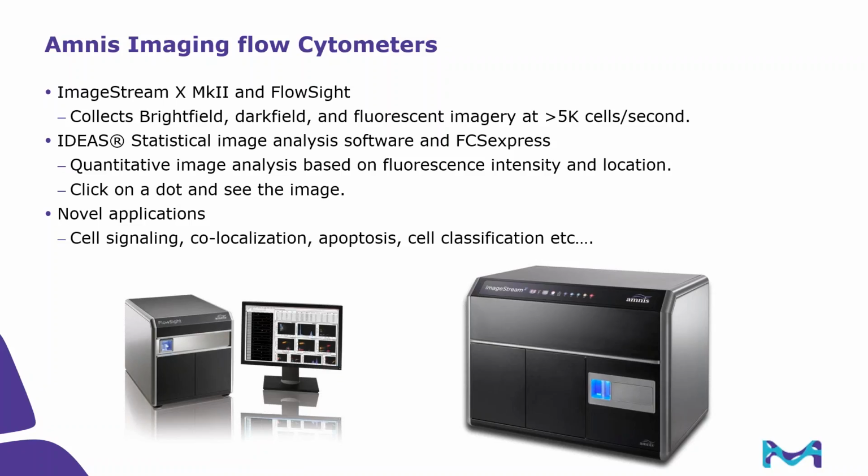One of the advantages of our approach is you can click on the dot in a dot plot and see the image, and this technology enables novel applications such as measuring and quantifying colocalization, apoptosis, looking at signal transduction cascades, as well as morphological cell classification. And it's really agnostic to discipline, though it's broadly applicable to many research fields.